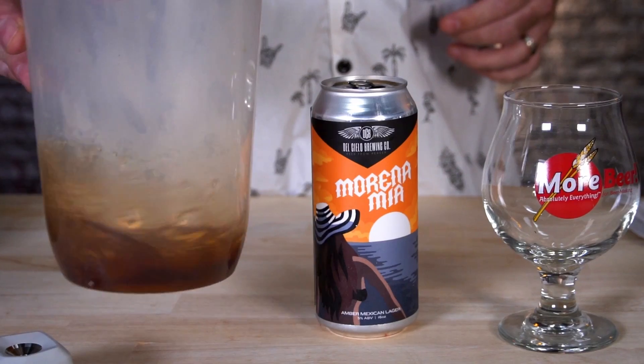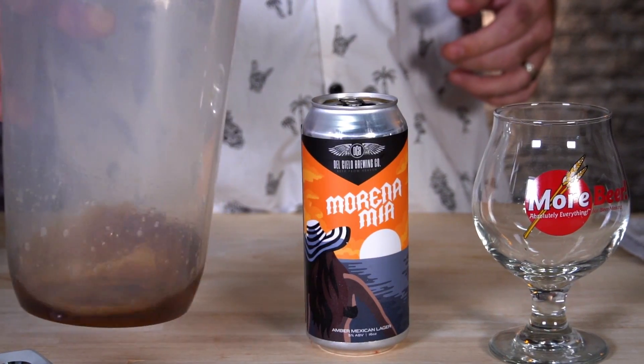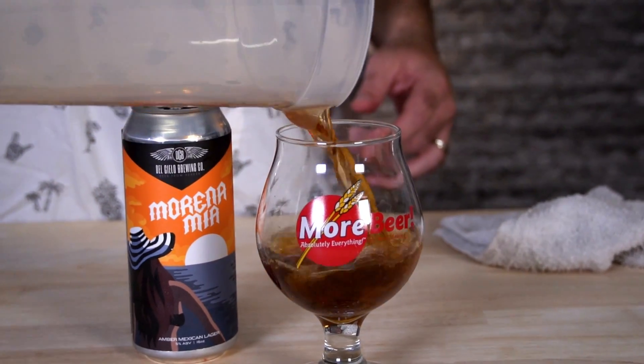The first thing we want to do with any sample, since we're going to be using the EasyDens, is degas it. So I poured this into something off to the side, shook it, and let it warm up to allow all that CO2 to escape. You want to make sure you degas whatever you're going to take a measurement of, because we're using the EasyDens as well as the SmartRef.